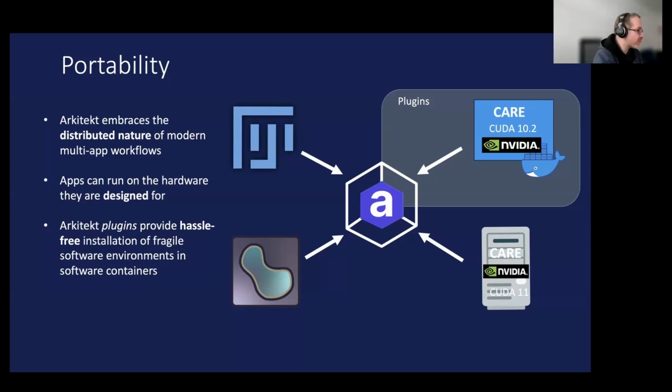Okay, so could I just sum up if I understand correctly? Instead of doing Napari Viewer, install all plugins, you go into Arkitekt, install the plugin, and it will have the list of plugins in a Docker, so it has a different environment for each plugin. And then the Napari Viewer just connects using Arkitekt to the plugins you install. Exactly. It installs it, runs it, and then sends it back. A very smart solution to have Napari with many tools at the same time.